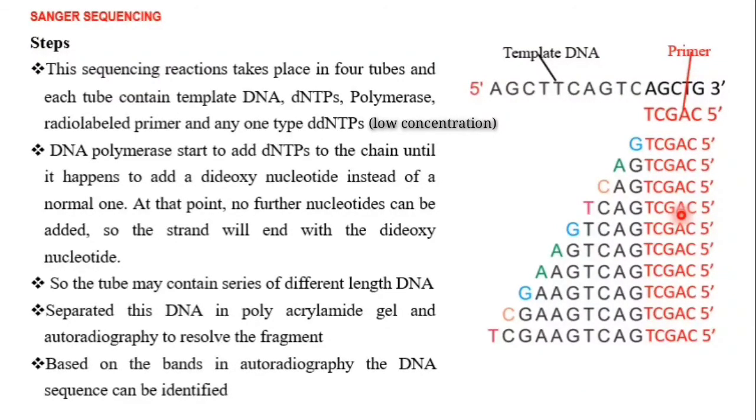varying length. We'll get fragments with varying length, and that different-length DNA is separated by polyacrylamide gel electrophoresis, and the bands will be identified based on autoradiography.